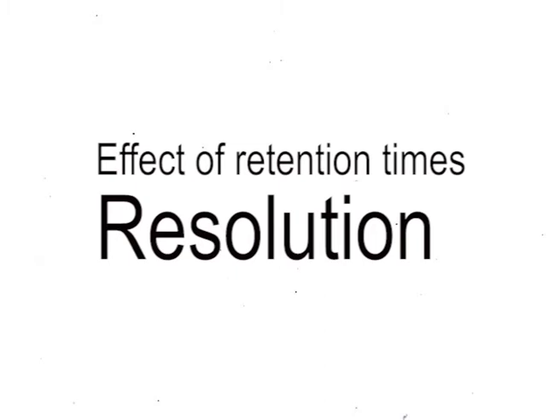Effect of retention times, which is also called resolution. The resolution is a measure of how well two adjacent peaks are separated by a column. Baseline separation should be achieved for complete resolution. Figure 5 illustrates the performance of 3 columns with different resolving powers for 2 components A and B.